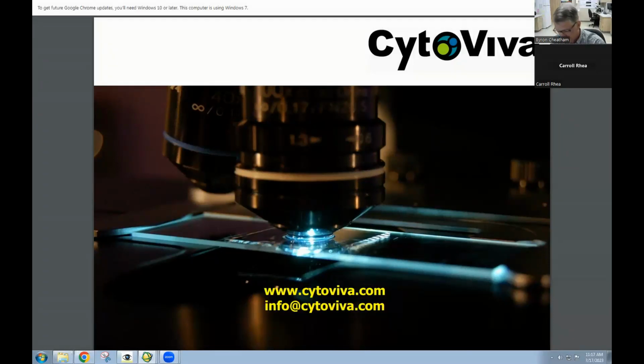All right, thank you. Could CytoViva track nanoparticles inside organoids that have deep thickness? We do have some recently published papers looking at organoids and nanoparticle uptake. As I just understood from someone the other day, the FDA here in the US is planning to start accepting organoid and spheroid-related data potentially for drug delivery in lieu of in vivo studies, which is very interesting. And yes, if you're interested, we could send you some papers on organoid-related nanoparticle imaging with the tool, where people are trying to get those nanoparticles further and further inside the organoid, with mixed success, I would say, based on some of the data I've seen so far from the CytoViva system.